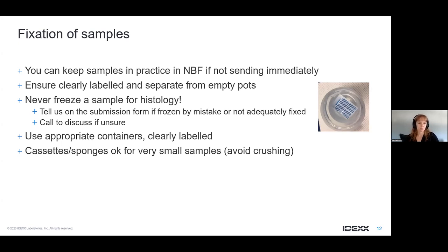We are obviously providing containers, so this is the best that you can use. It's not advisable to use any glass containers or any Tupperware or anything else. The containers, or pots, that we provide have a good lid, they close properly, and they don't leak. So this is what I would always recommend.